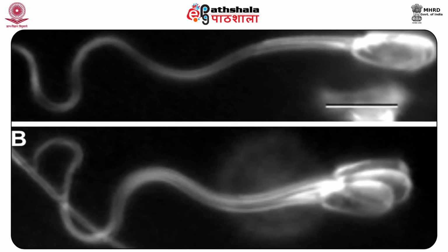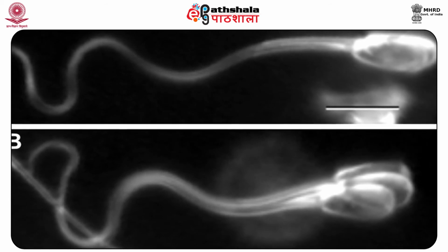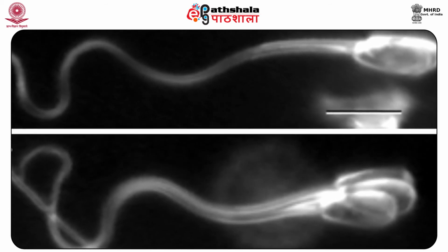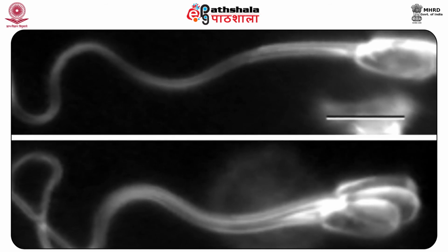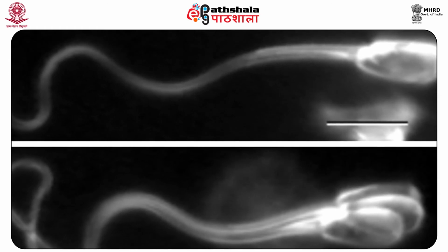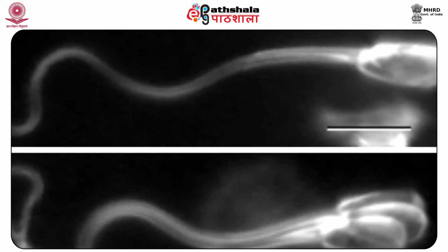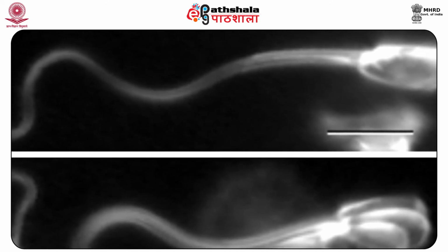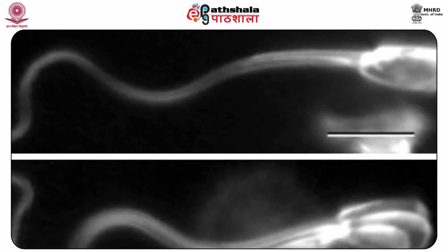Now, microscopically identifying spermatozoa is an absolute indicator that semen is present on an item. It is also useful because the relative quantity of spermatozoa and epithelial cells can be assessed. This determination becomes important during subsequent DNA analysis because spermatozoa contain male DNA, while most epithelial cells in a male-female sexual assault will contain female DNA from the complainant.